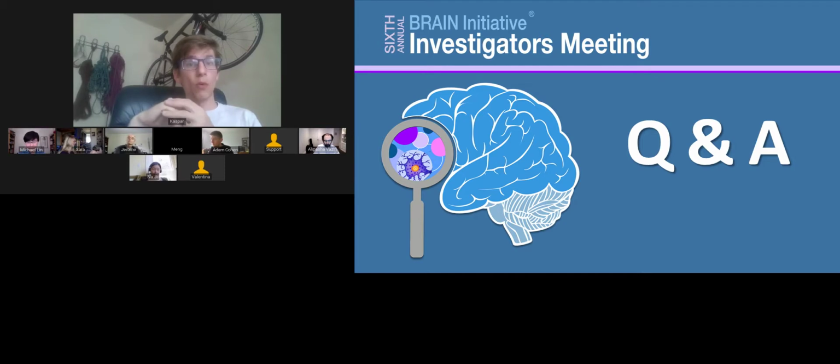So we don't get great SNR out of GCaMP because GCaMP excites about 14 times more poorly at 1030 than it does at its peak. We have done imaging with GCaMP. GCaMP is a great sensor, so you can overcome that. You can take that hit. But it was really great for us to move to yellow indicators. And iGluSnFR is very bright, especially under two-photon. It gives great signals, and we're only working on improving some of the challenges for using it for synaptic signaling. Great. I'm going to turn it over to Adam.